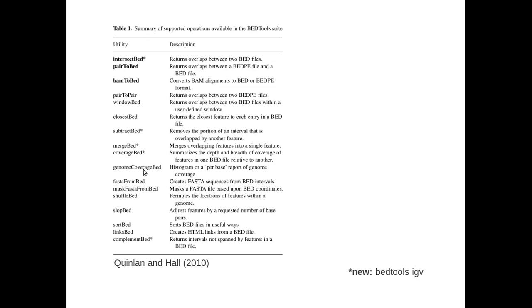Coverage you can extract quickly. Many things you can do here. Sometimes I think it's a good idea to just be aware of the flexibility of a set of tools like GATK or bedtools or VCFtools, because this is how you expand your bag of tricks that allow you to work efficiently and comfortably with these large data sets.